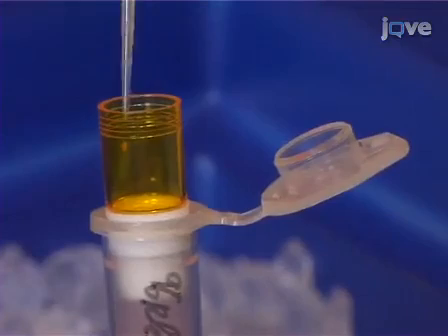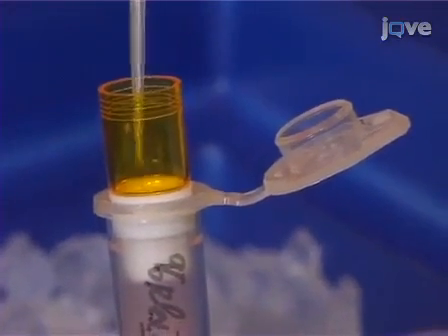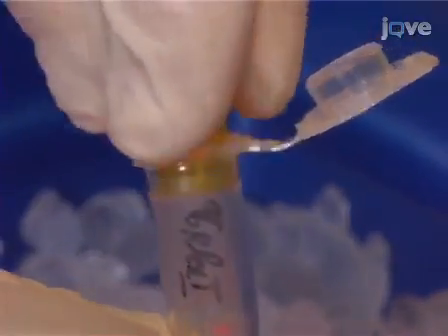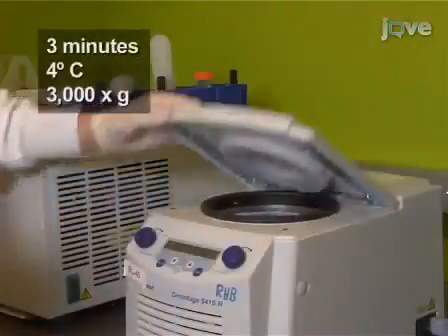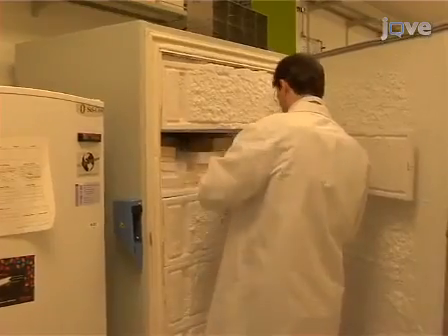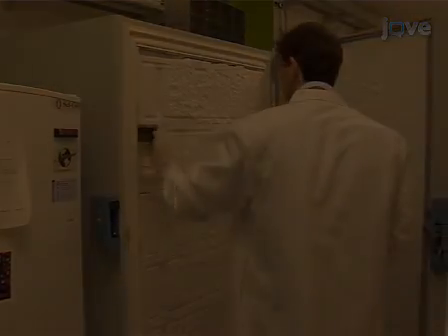To elute the RNA, add a desired amount of RNase-free water to the membrane. Invert the reservoir and place into a new vial. Then spin for 3 minutes at 4 degrees Celsius with maximal 3000 × g. Store the concentrated RNA at -80.